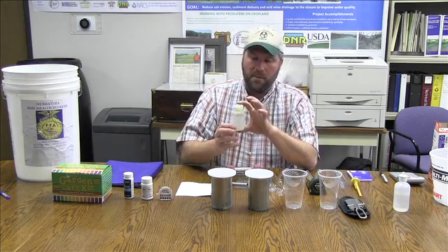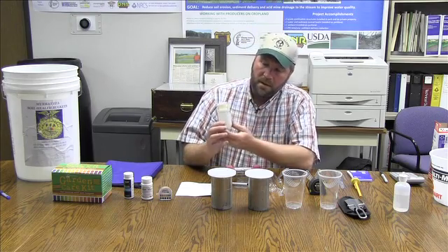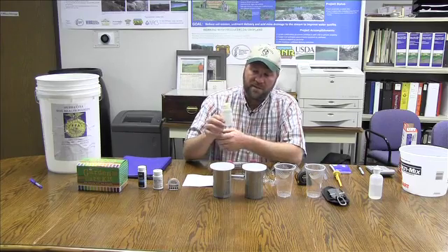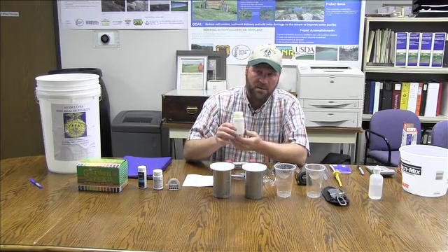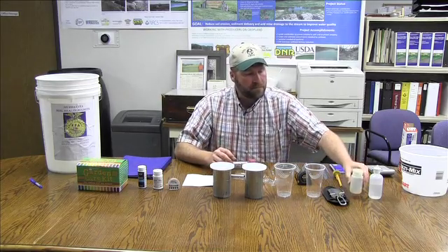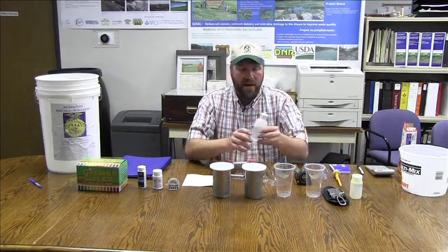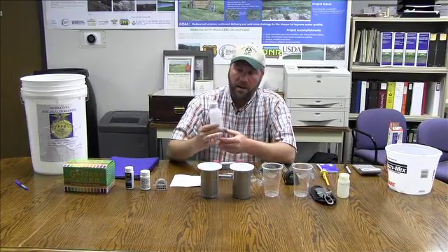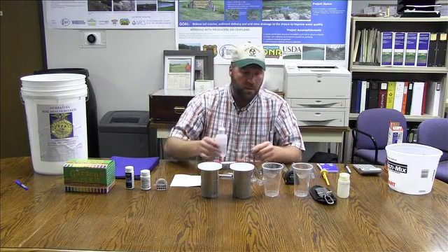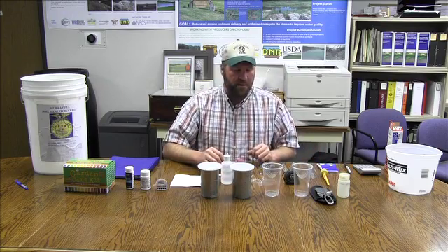There are little plastic bottles with a line filled to 107 milliliters. The 107 milliliters represents one inch of rainfall in a three inch cylinder. We also have a larger bottle with a squirt lid on top, so that you can squirt water into these and clean them out when you are in the field.